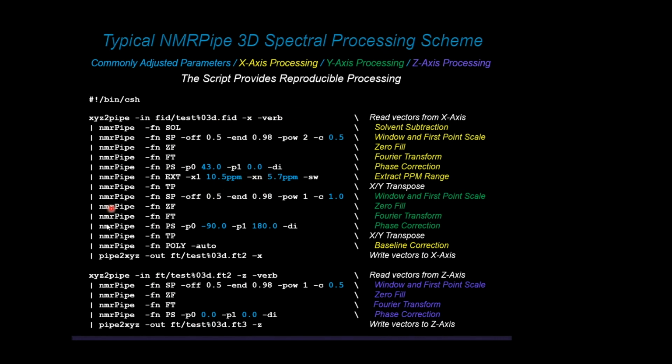But once we're comfortable with this scheme of doing things, there's almost no limit to what kind of processing and analysis that we could do with NMRPipe, because we can rearrange all the processing and analysis components in scripts.